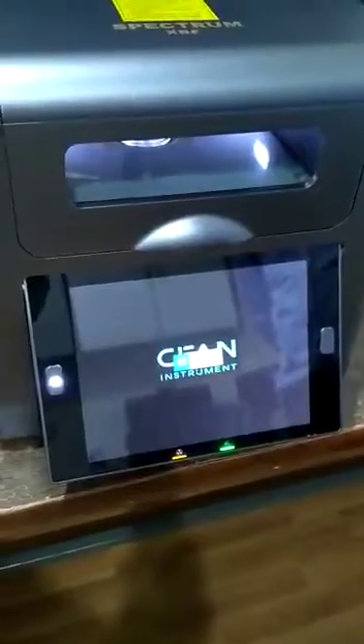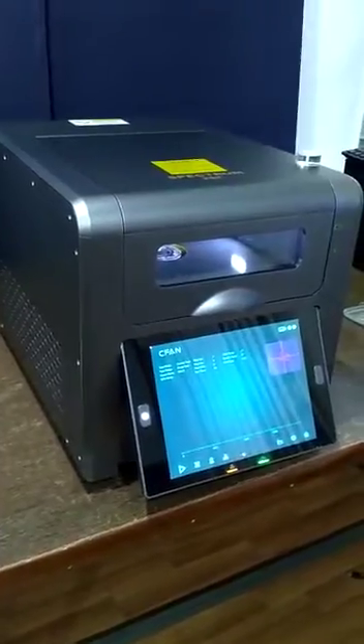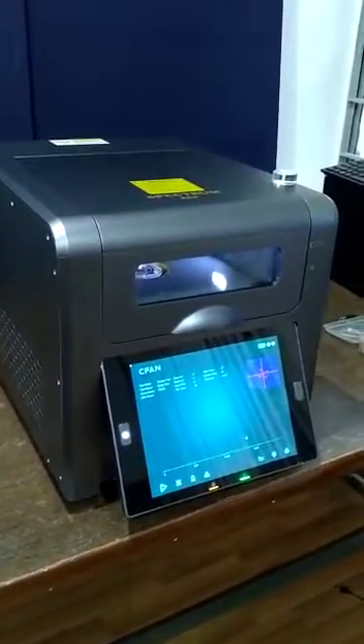XFS7 model. Switch ON the machine with this switch. It will take 5 minutes of warm up. After warm up, put pure silver sample for peak adjustment.